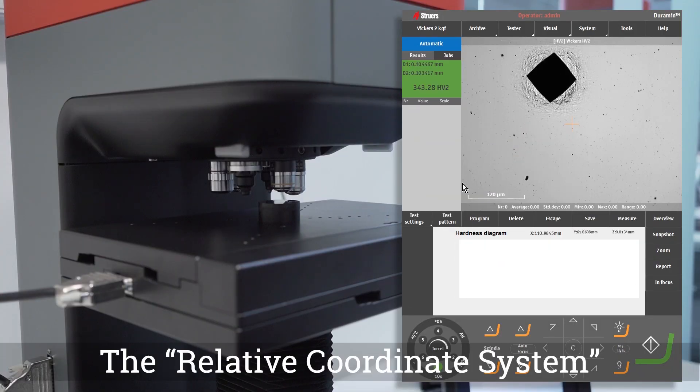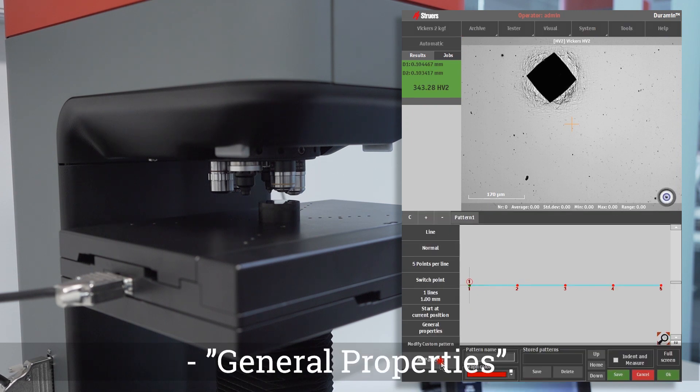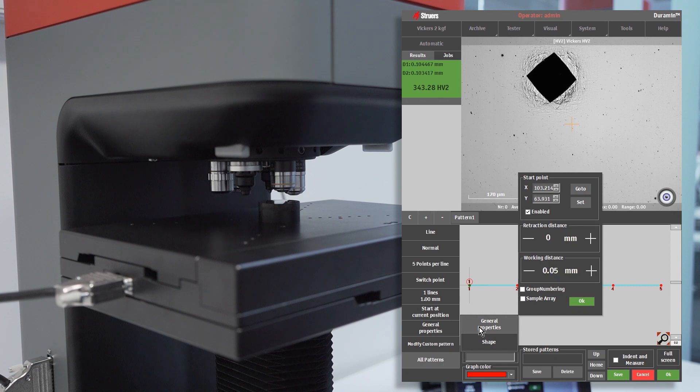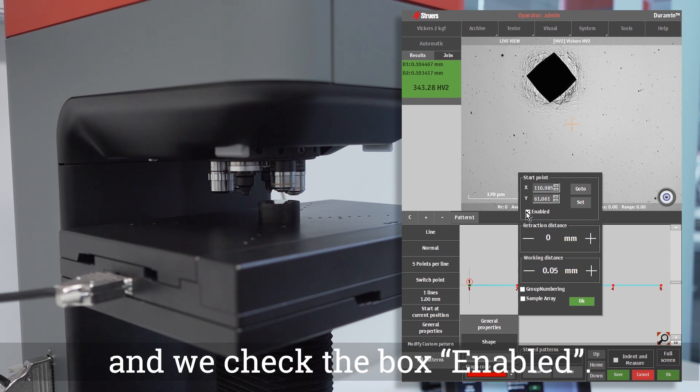The relative coordinate system is set from Test Pattern, All Patterns, General Properties. Here we define the center of the relative system, we click on Set and we check the box Enabled.